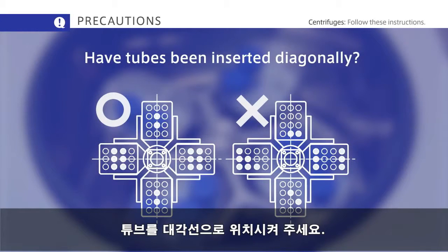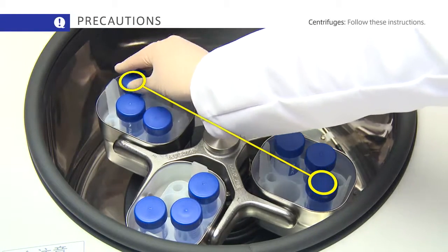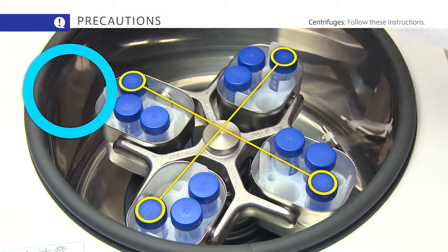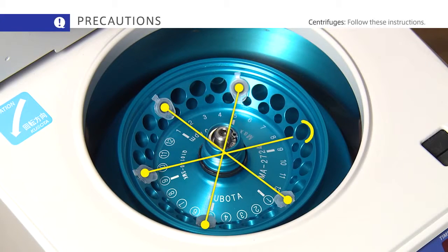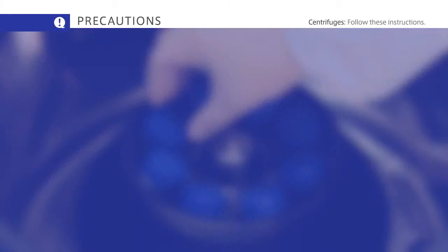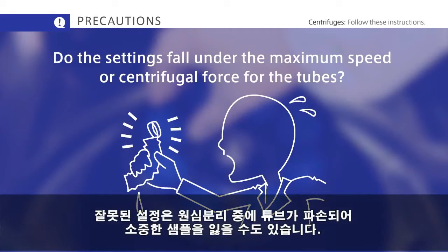Make sure the centrifuge tubes have been inserted correctly. Do the settings fall under the maximum speed and centrifugal force for the tubes? The wrong settings could cause tubes to break down during centrifugation and lose your precious samples.